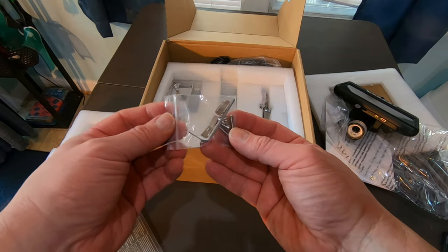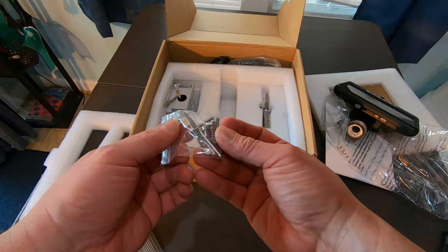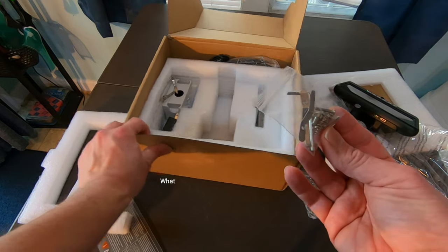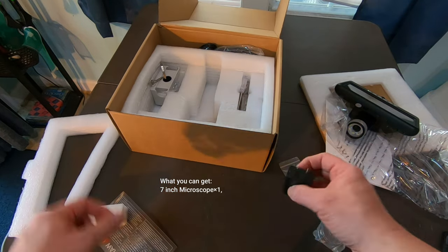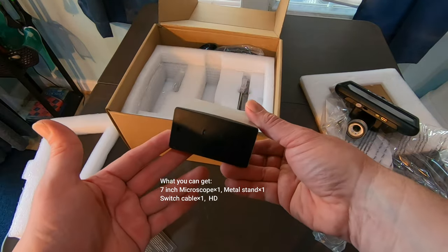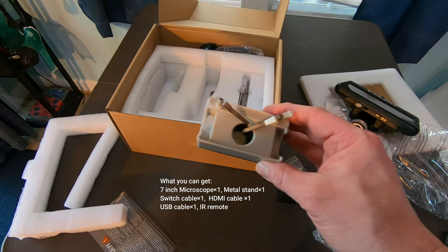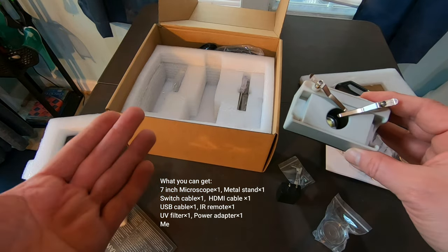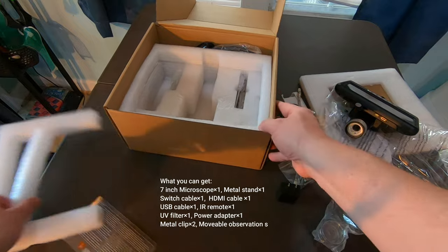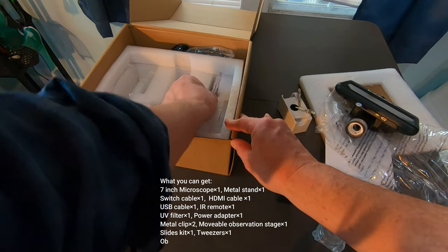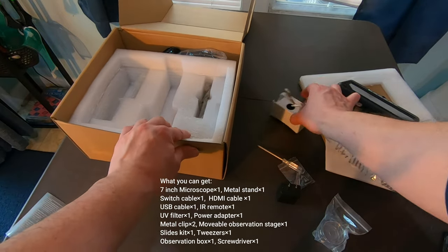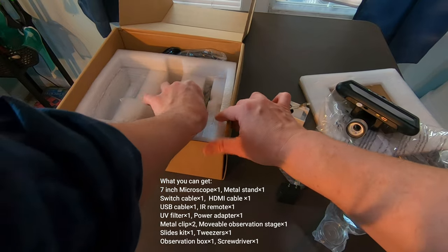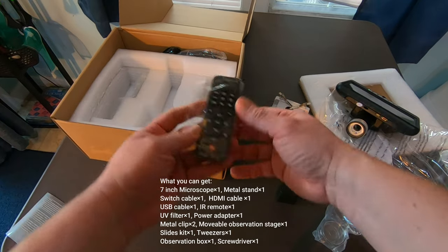Like you can look right down there and look at them nicely. Kind of cool. So I got to find a little critter and put them in there. We have some more pieces here. This is probably for keeping the lenses in place. Have our plug. Now, this is my first digital microscope. I actually have a regular microscope, a good old fashioned mono. I don't have any stereo microscopes. Just a regular mono is the one I have. But this is going to be my second professional type microscope.